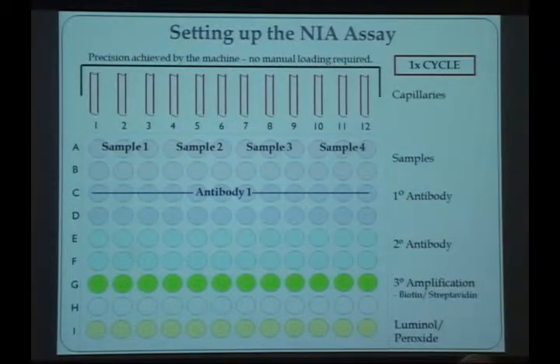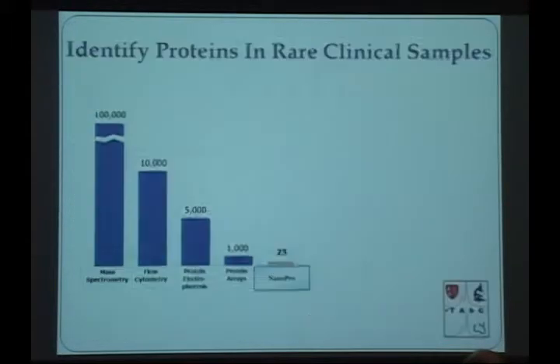In one experiment, you can use up to 96 capillaries, but in a practical sense, people usually load maybe 2, 3, or up to 4 rows of samples, and then have different combinations of antibodies that the samples can be cross-reacted with.